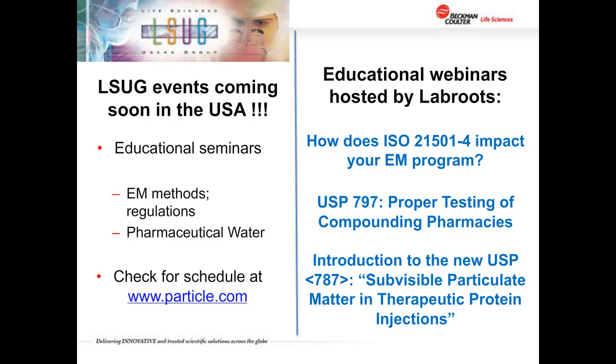It's like, oh, don't worry about that point. It always goes high at this time, and it doesn't affect anything. Stop taking data. Look at that again as a part of an annual or maybe biannual review every 2 years. Look at your methods and say, does this still make sense to be taking this point, or even should we add them? But in most cases, the number of monitoring points will be a small subset of what you do for classification.